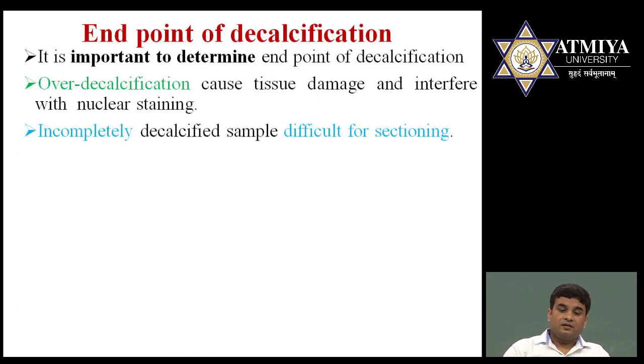The end point of decalcification is the most important point while using the different types of reagent, because if you don't know the actual end point of decalcification, then it may cause either over decalcification or incomplete decalcification. In that case, what will happen?